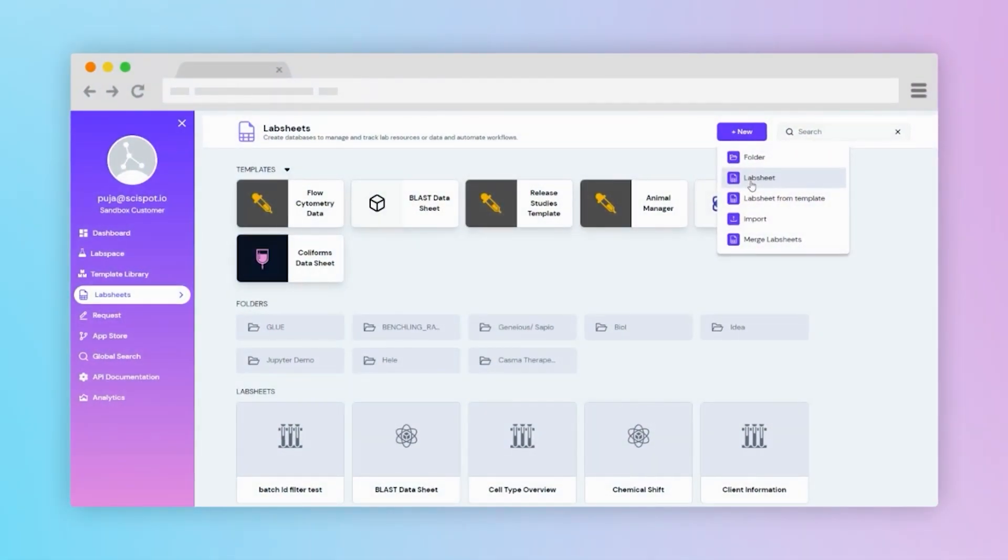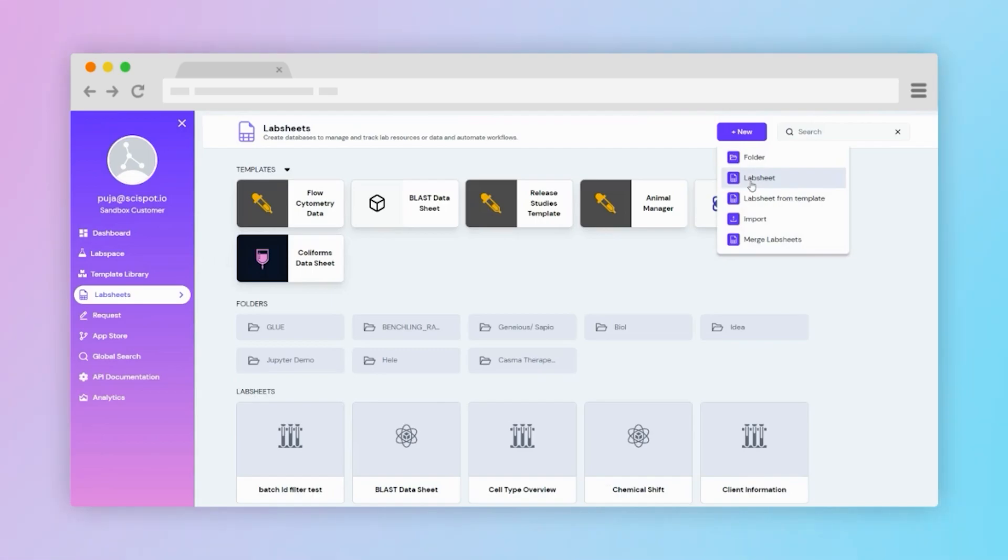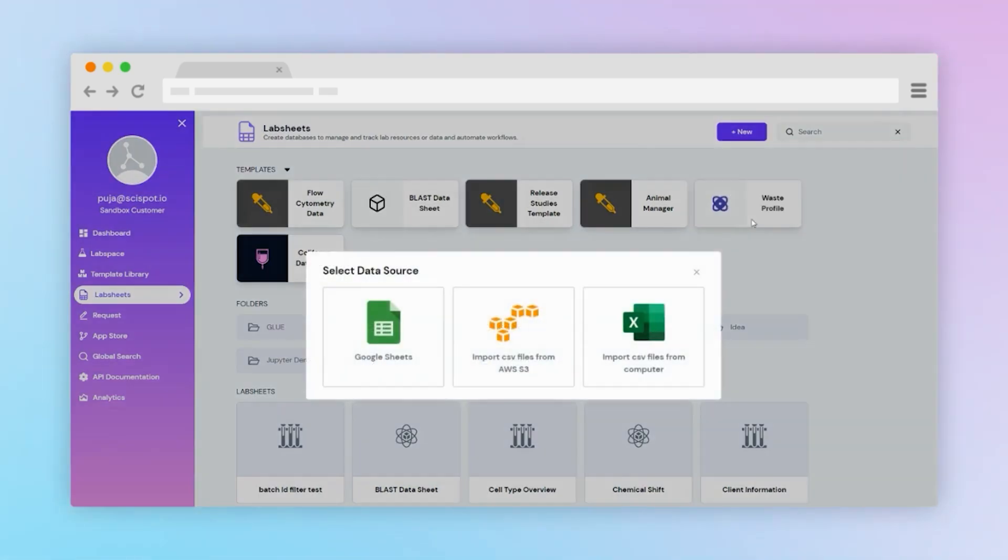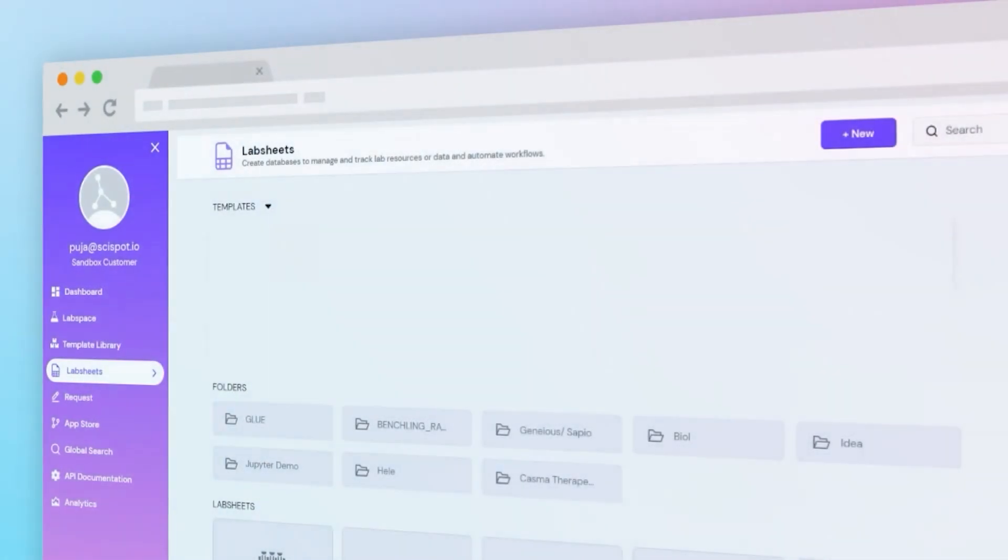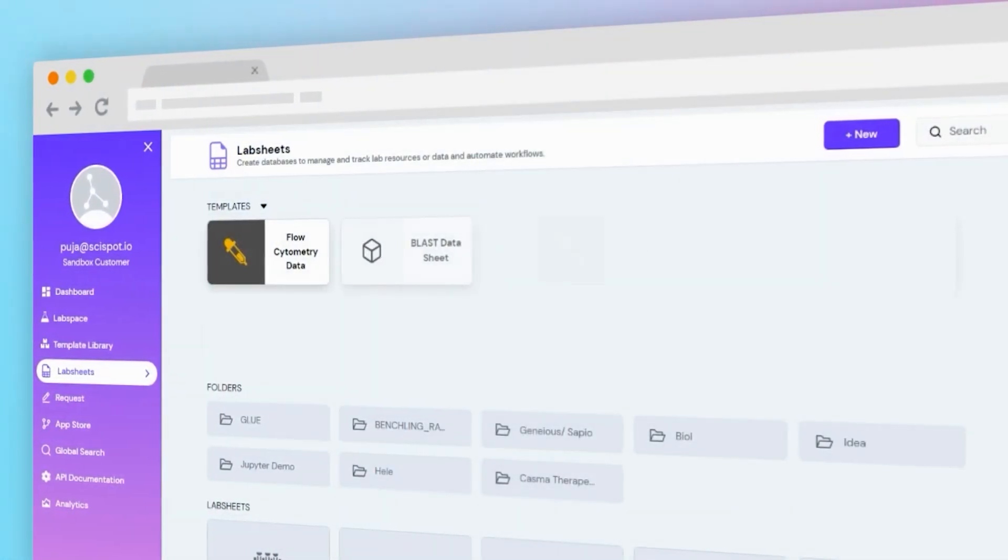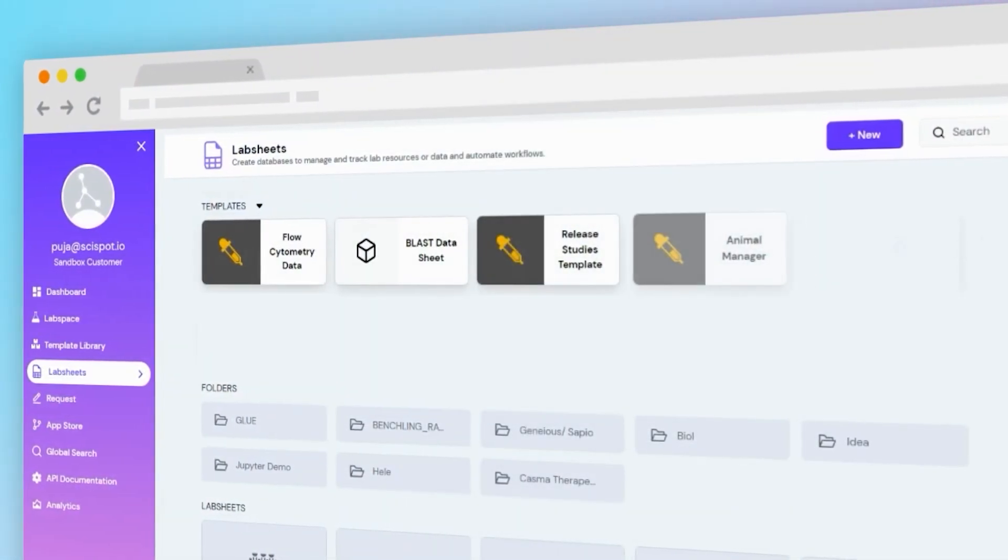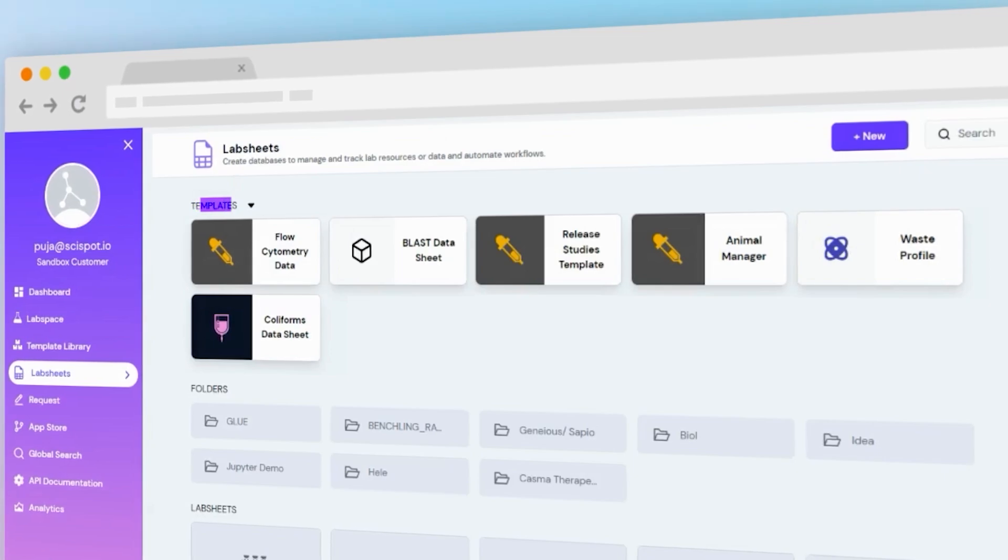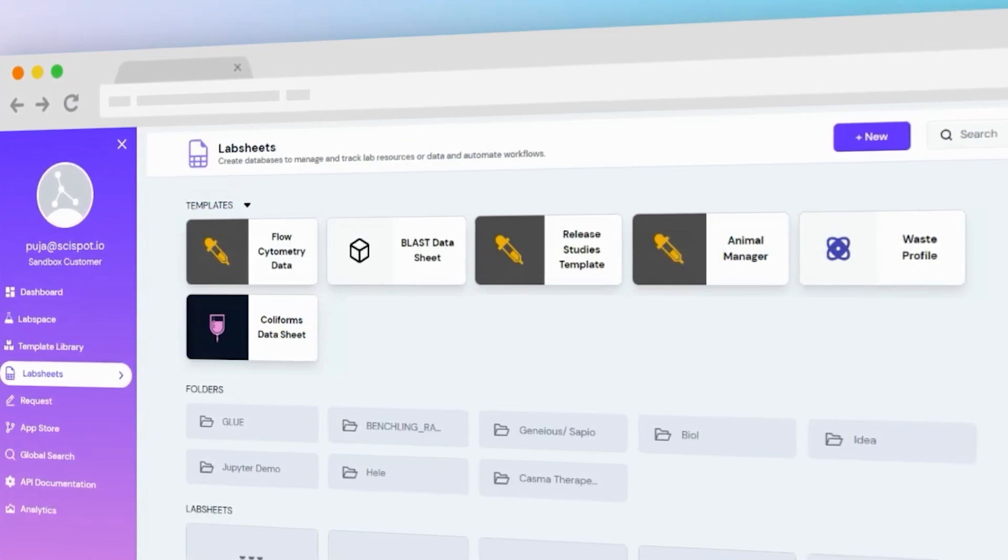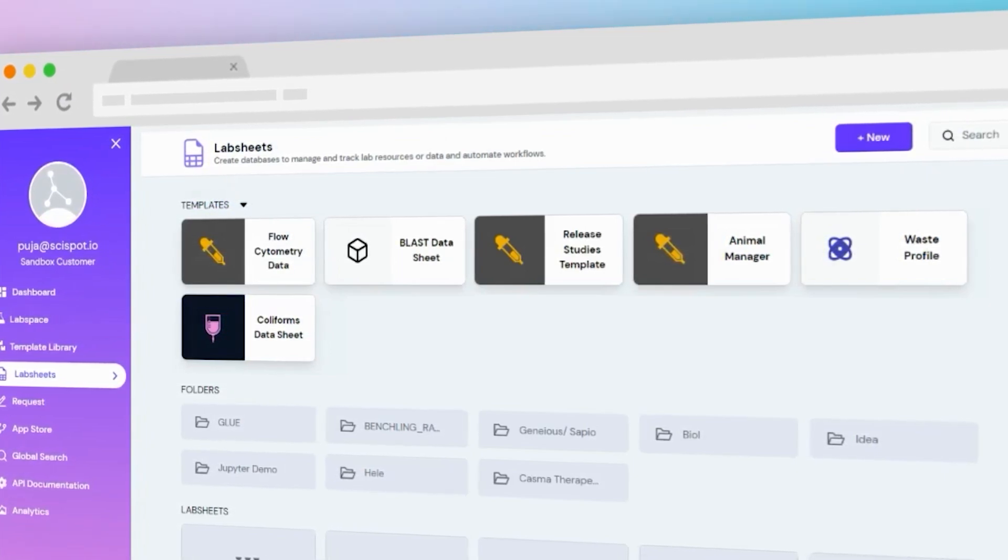LabSheets is an advanced data management system within SciSpot. Users have the flexibility to create custom data structures from scratch or import data from Google Sheets and CSV. The platform also offers a range of pre-designed templates to suit various use cases.